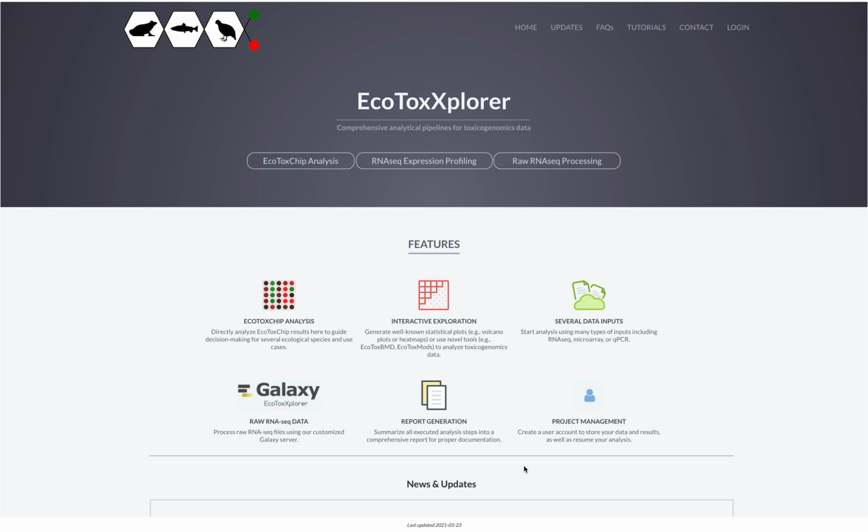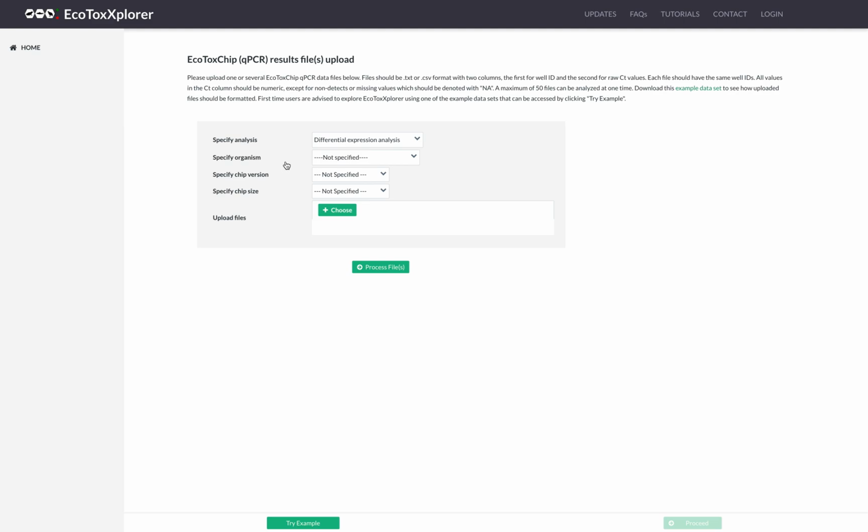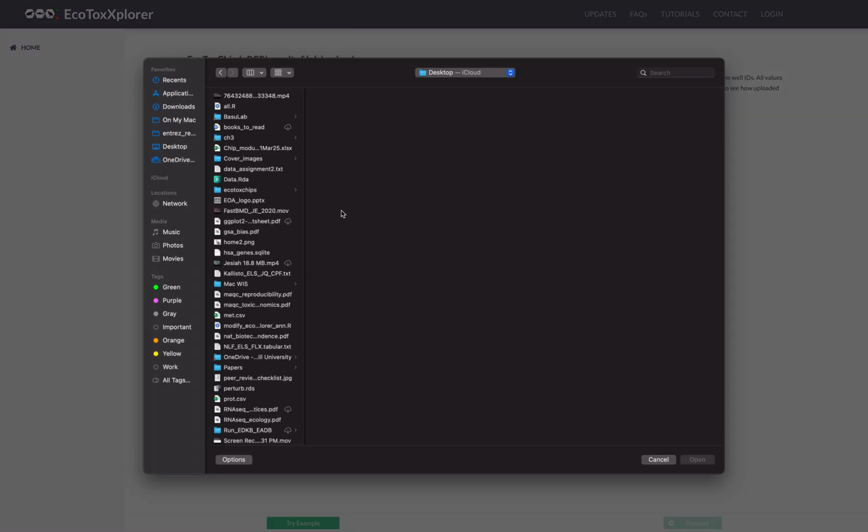In this video, I'll do an example EcoToxChip analysis. So from the home page, we start by clicking here. And so this is the upload page. We'll be doing a differential expression analysis with some Japanese quail data, version 1, 384 size chip.